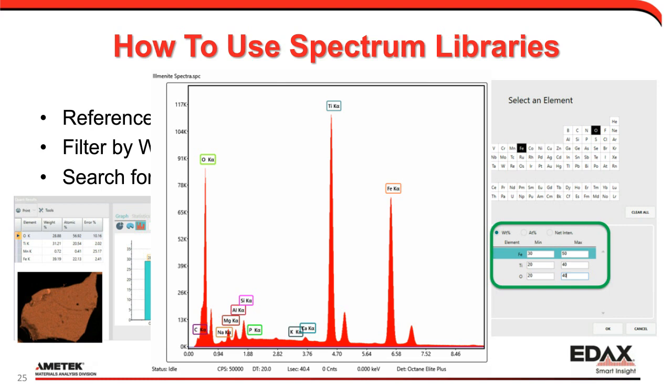So truly when we search, we're searching based off a vast amount of data. It doesn't have to be our own system, doesn't have to be our own conditions, doesn't have to be the same detector at all. We could have flexibility with whether it's a different detector, older generation detector, a newer detector, whatever it is, we can come up with these matches based on this criteria. So truly powerful to help us solve our question of what is it.